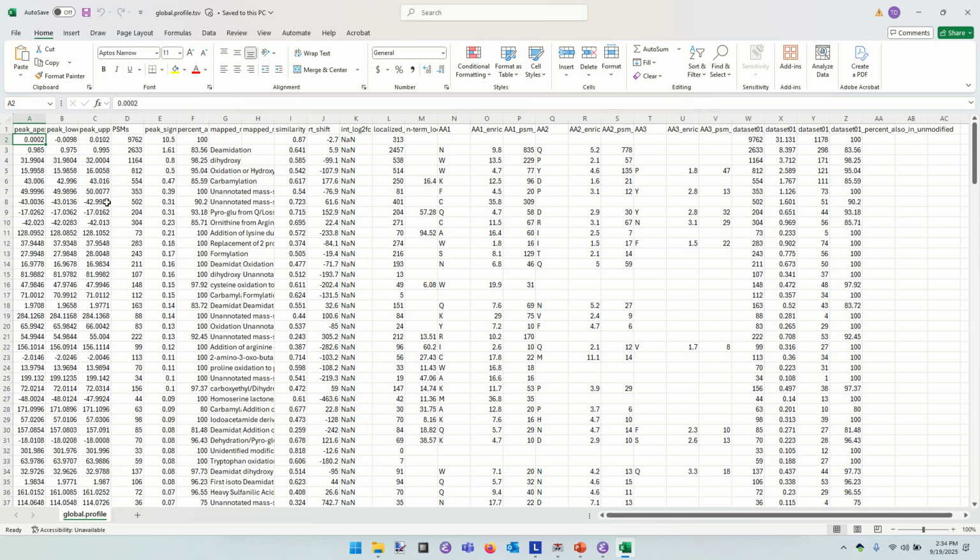All right, as we move to the next line, however, we get to deamidation. You remember we saw a very large number of PSMs that could be made if we allowed for a 1 Dalton mass error. And that's included in ordinary searching, actually.